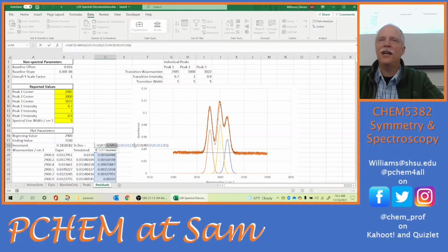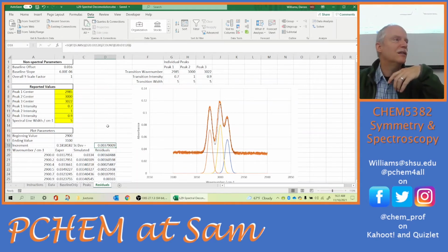Now, sometimes in the standard deviation, we say N minus 1, right? But that's only if you have a small data set. We have 1,100 data points, so we're not going to fiddle with any minus 1. 1,100 versus 1,100 minus 1 is not that different. So in the denominator, the count is just counting how many cells we have. And so we have the average, a mean of the differences squared at this point. So we're going to take the square root to get rid of that square magnitude. And so we have the square root of the whole thing. That's kind of our standard deviation. So this single number tells us how good our fit is.